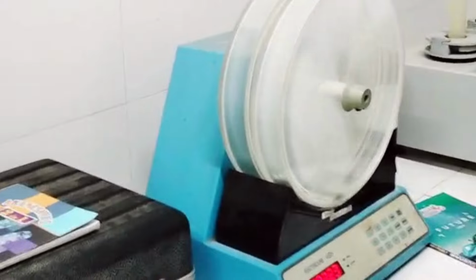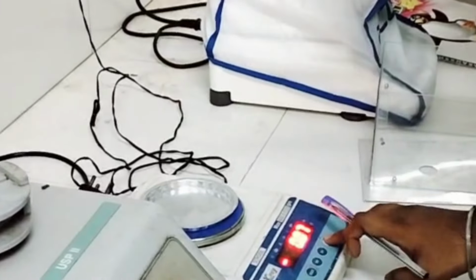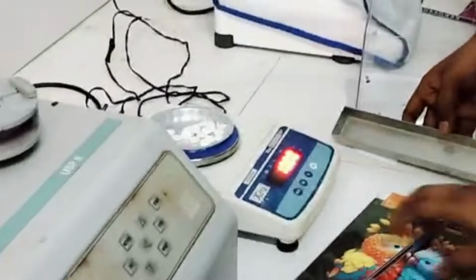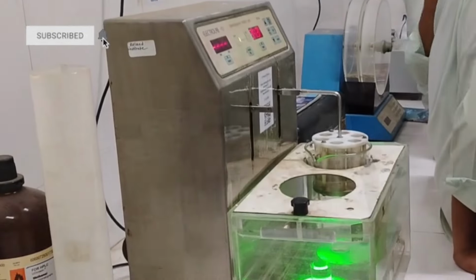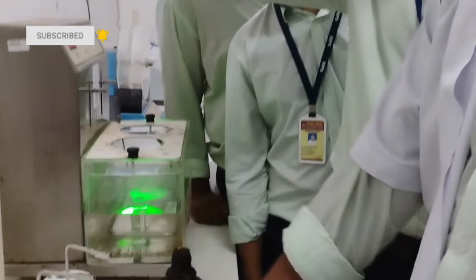It is necessary to avoid any sort of errors during manufacturing, and as a result, evaluation of tablets is very important before dispatching the batch. Before a tablet is released into the market, it has to pass a few quality checks, which is mandatory. Evaluation of a tablet includes the assessment of the tablet's physical, chemical, and biological properties.